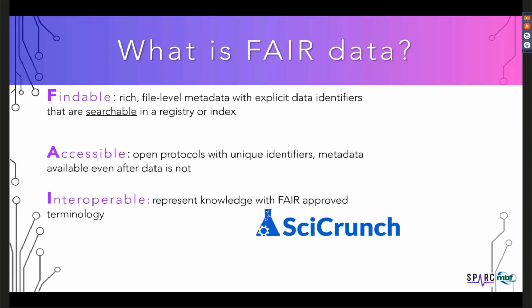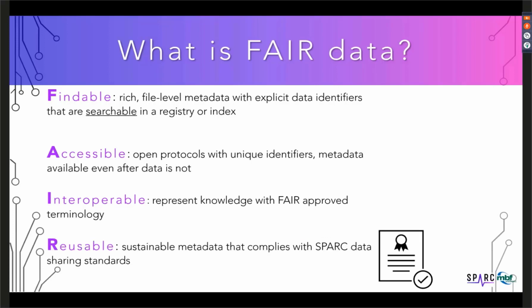To be interoperable, the data must represent knowledge with FAIR-approved vocabulary in a broadly understood language to allow other systems or software to make use of that data. Our link to SciCrunch allows for this. To be reusable, there must be sustainable metadata that complies with SPARC data sharing standards. File-specific metadata is written to each segmentation file recording the information about the sample using MBF Bioscience software.